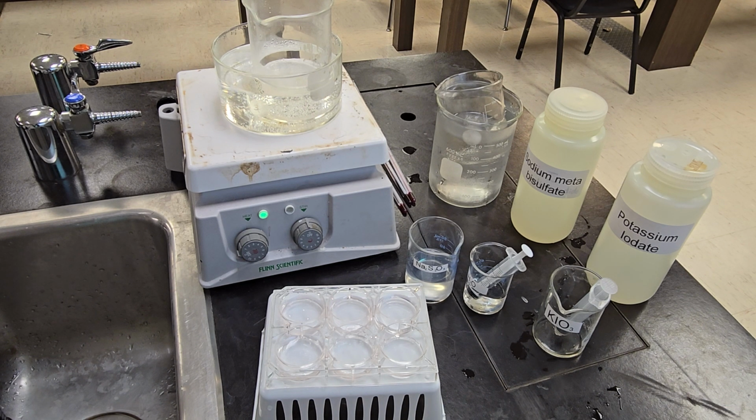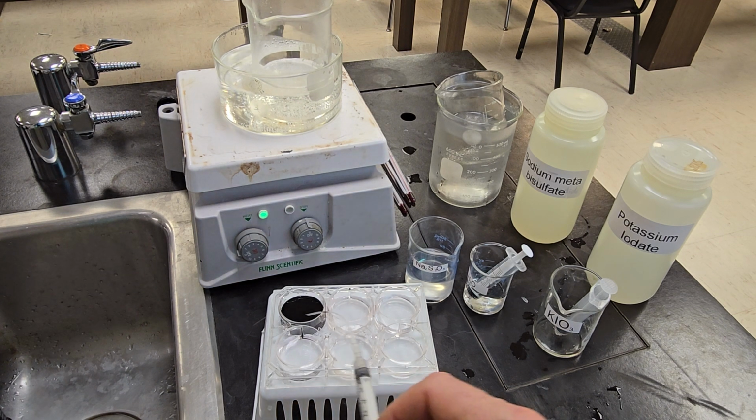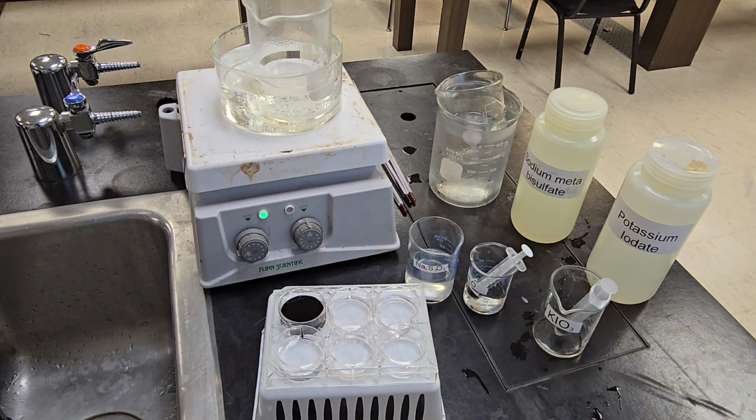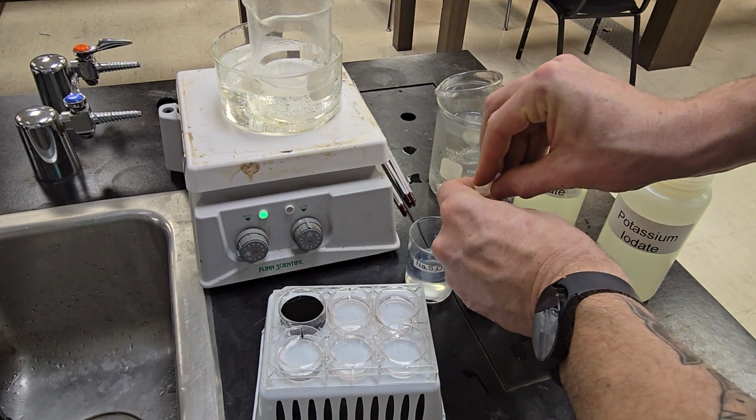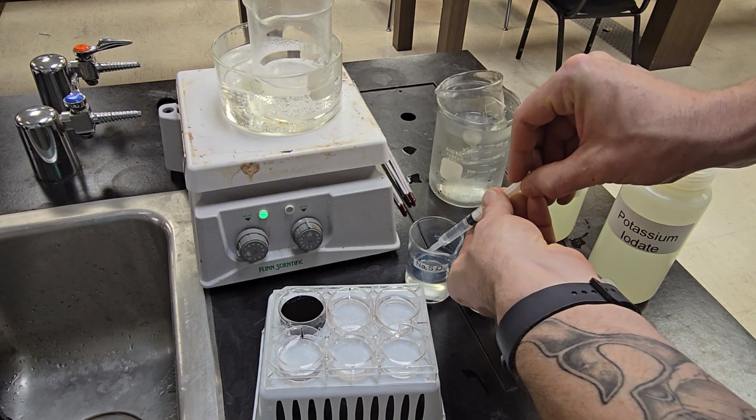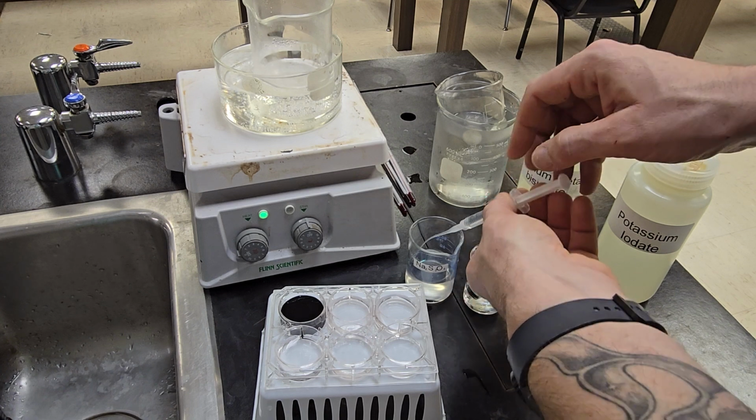Remember, this is plate number 1. This had 5 milliliters, and our reaction has started. You can see the reaction once it starts happens pretty quickly. Okay, now we're going to do plate number 2, well number 2. Again, pay attention to the time mark on the video below. If you don't catch the time signature, go back.